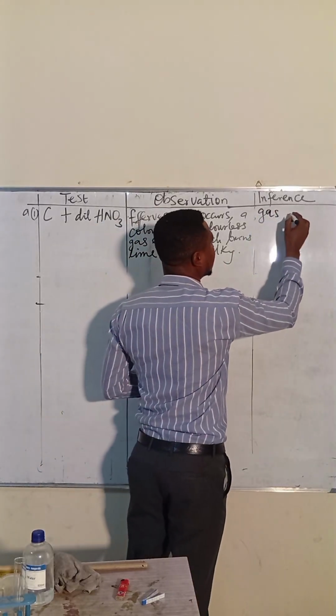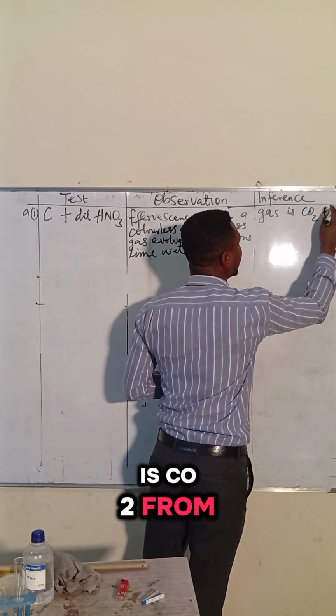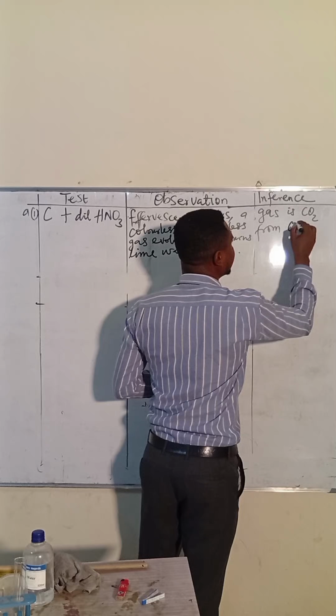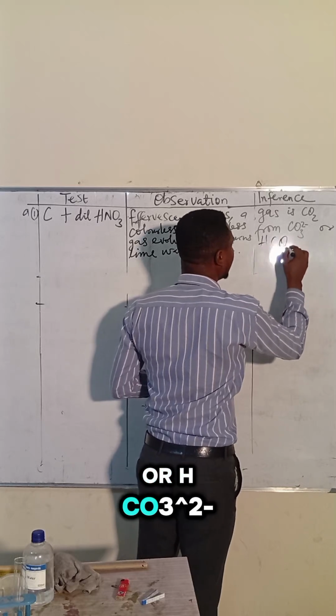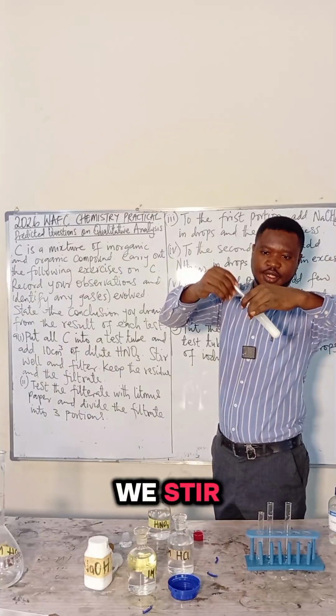Gas is CO2 from CO3 2 minus or HCO3 minus.